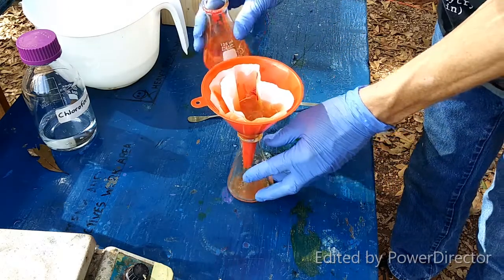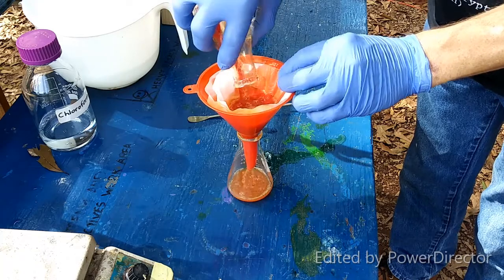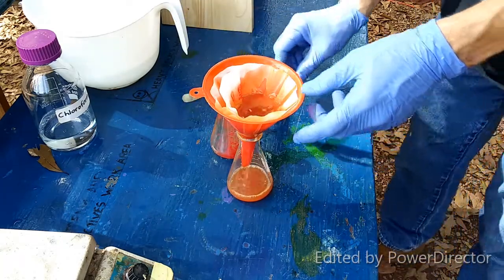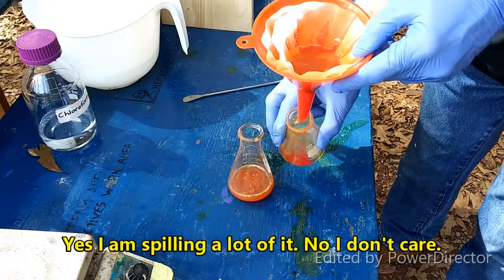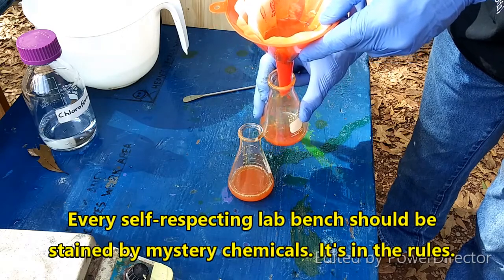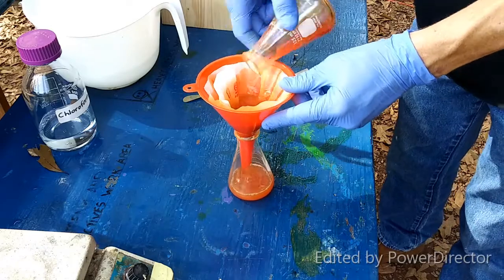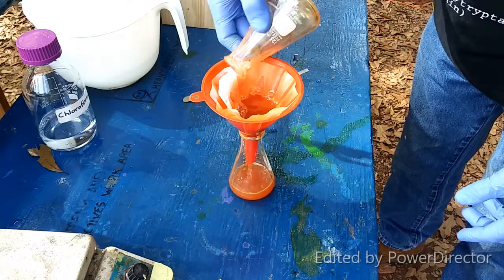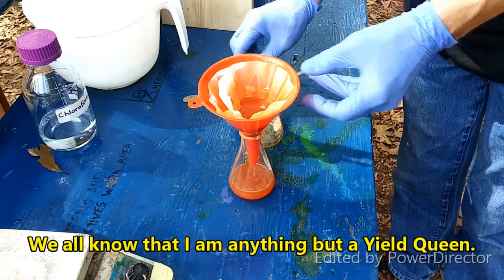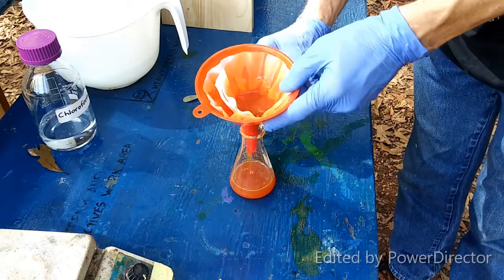Yeah, this is a little thing I like to do where you just use the filtrate to keep rinsing stuff back down in there, because you know it's not going to be soluble in the filtrate. And of course, you should absolutely not look to me as your example for good lab practice. Not how I do things here, anyway. At work, it's a different story, but here, maybe not the best example.